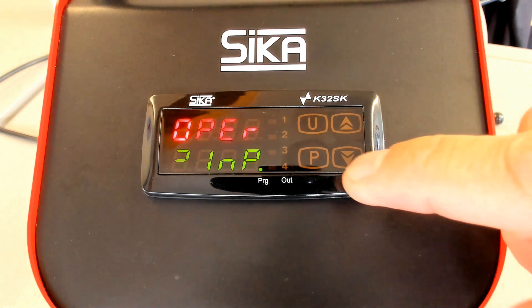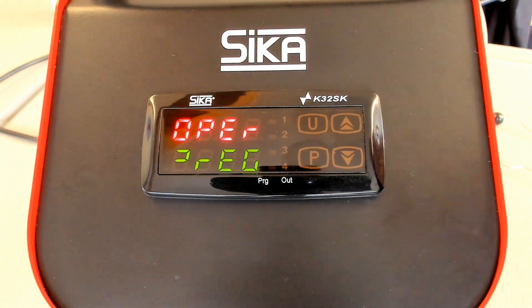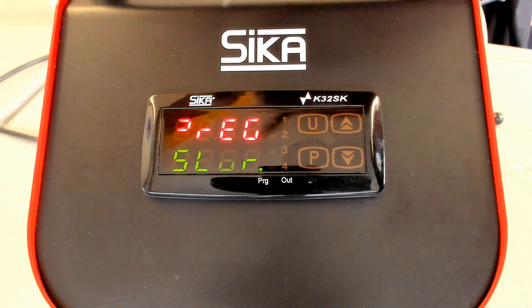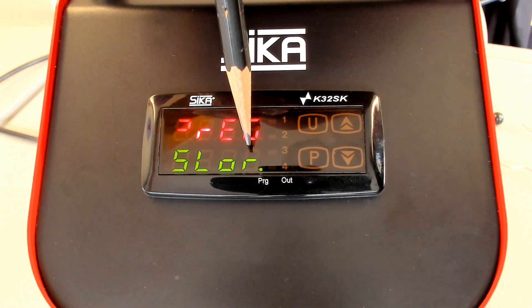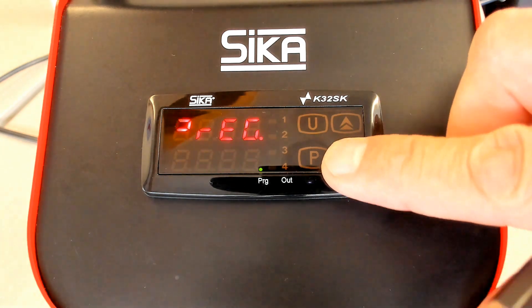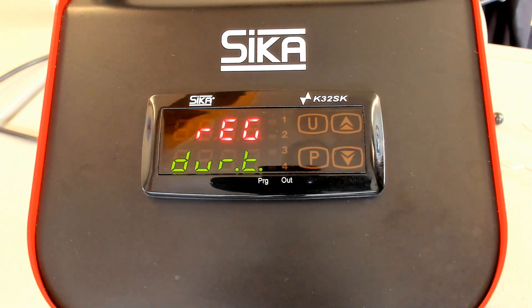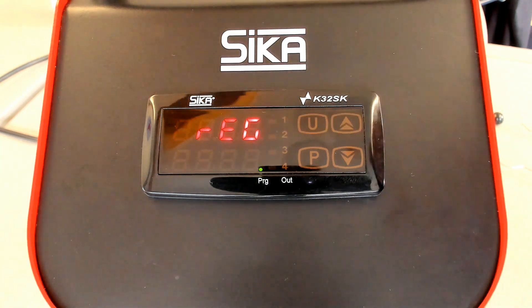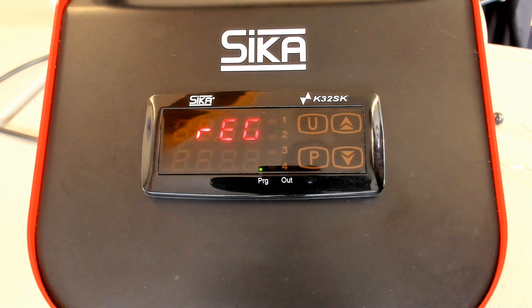Last but not least, I'd like to show some contents of the REG group, which is regarding the control. Here we find different parameters: SLOWER, which means this parameter is for slow rising — so you can program a ramp in the dry block calibrator. Then there is a duration time parameter — if you increase the temperature and want to hold it, you can program a duration time. And we also see SLOTH, meaning slow level down. So you can program a full ramp with a rising temperature gradient.